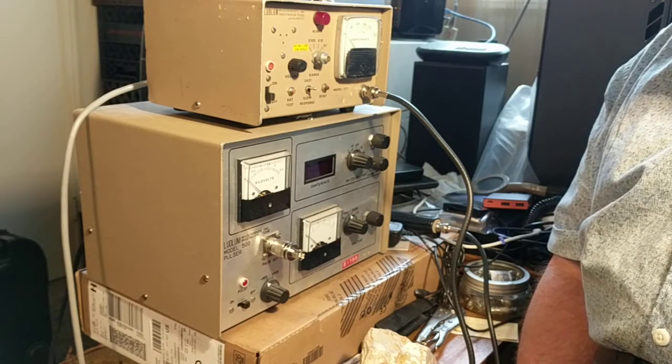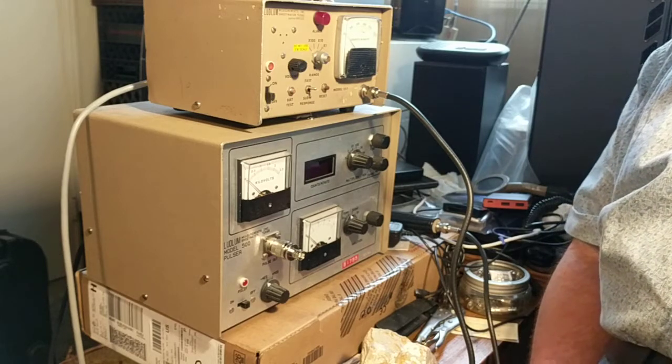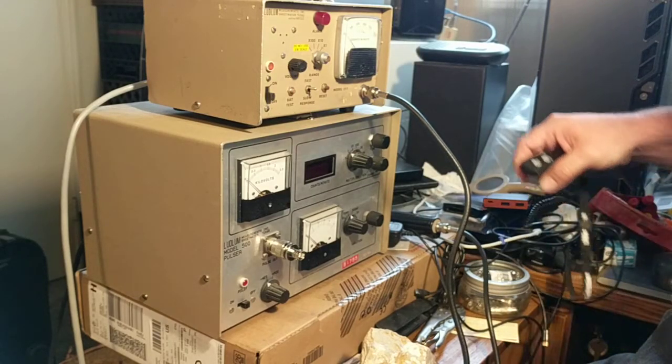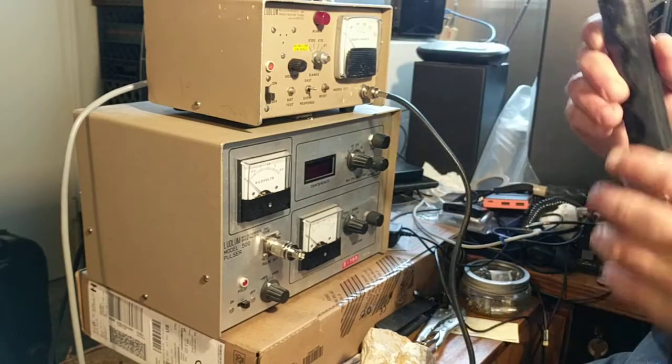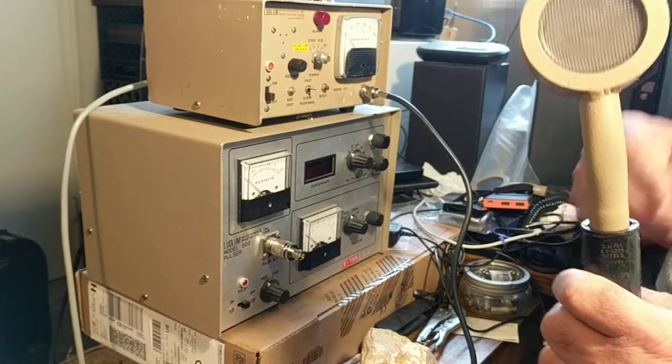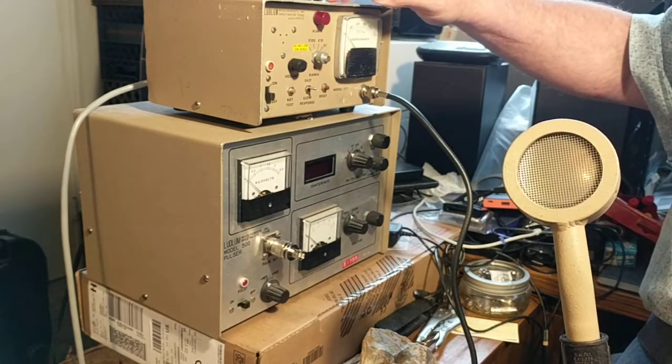This is Boudin demonstrating the calibration of the Ludlum model 177, also known as a frisker. Those of you who don't know what a frisker is, it's typically used with a probe to frisk people to determine whether or not there's contamination.